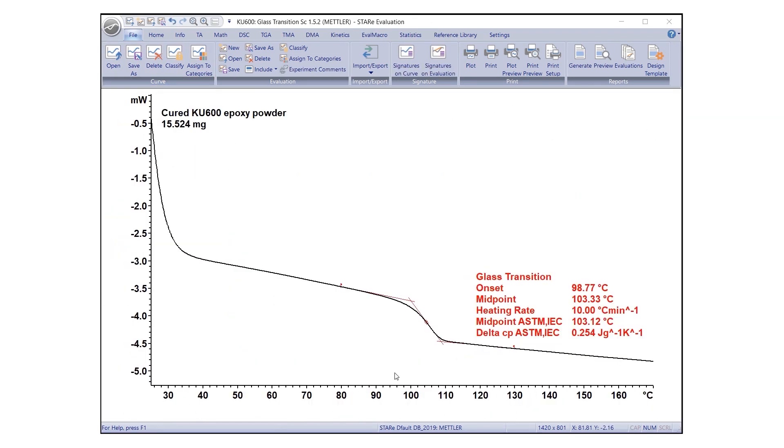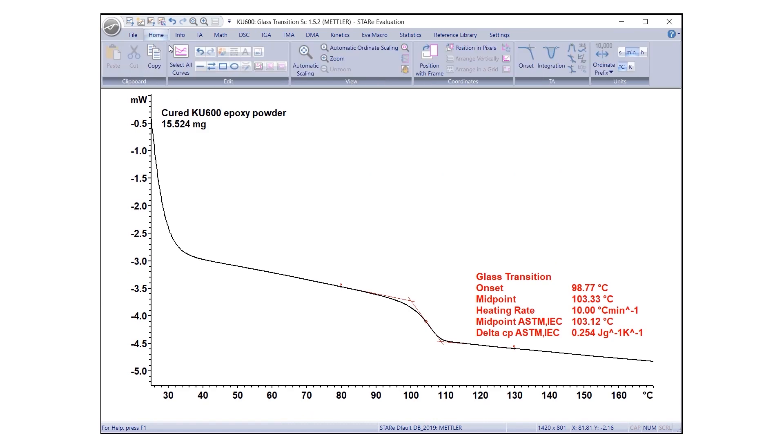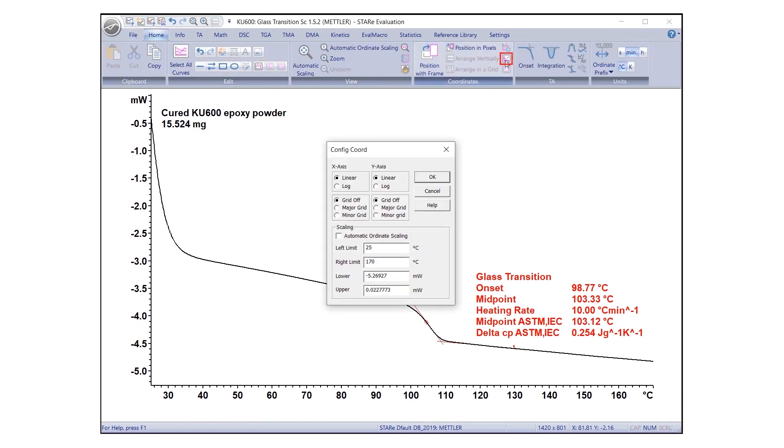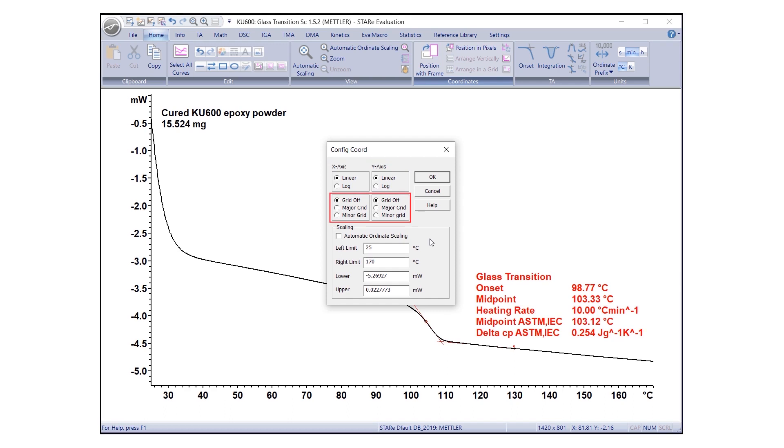Configure the coordinate system by selecting the configuration icon under the Home tab. A dialog box will appear where you can define a linear or logarithmic scale, define major or minor grids, and set axis limits. Checking the automatic scaling box will automatically disable the upper and lower limit fields.